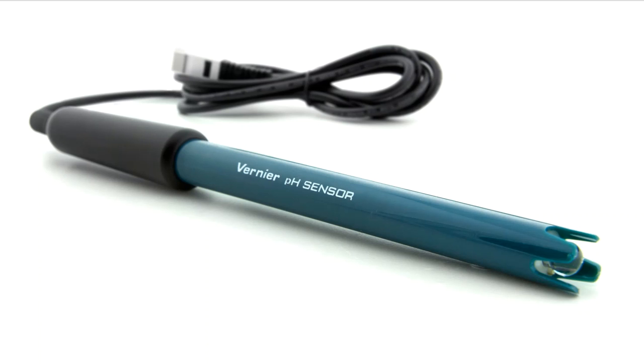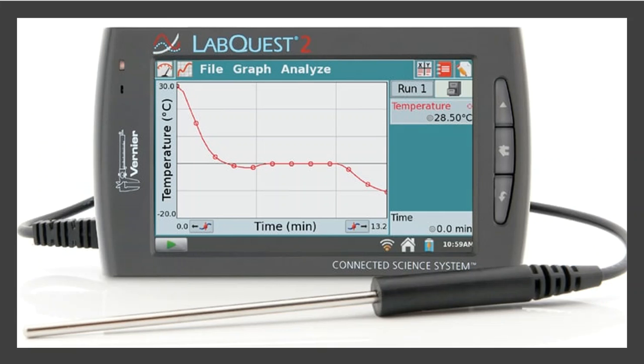So here's a pH probe. This probe goes down into the solution. This is what measures your pH, and that probe is connected to basically the pH meter. And for this, it's actually the LabQuest device. The LabQuest is designed to be the pH meter part, and your probe gets connected into the meter, and this meter will give you a readout of the pH.